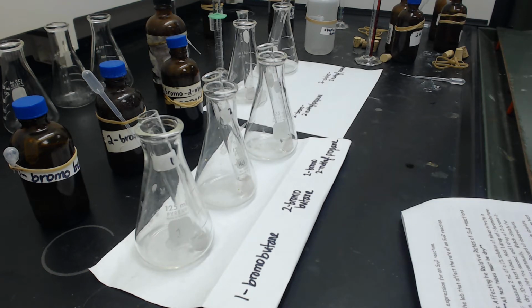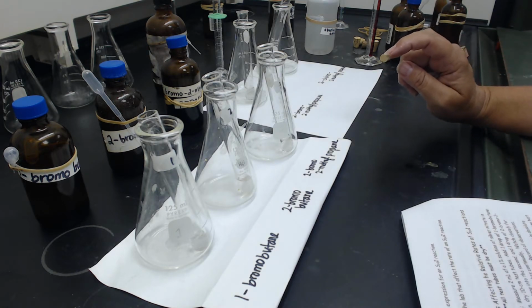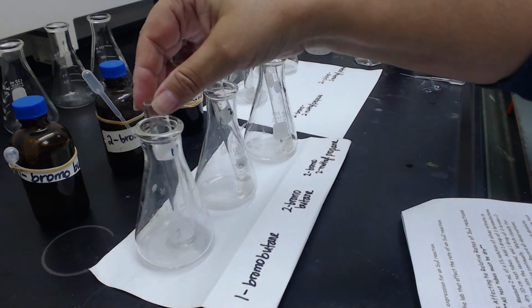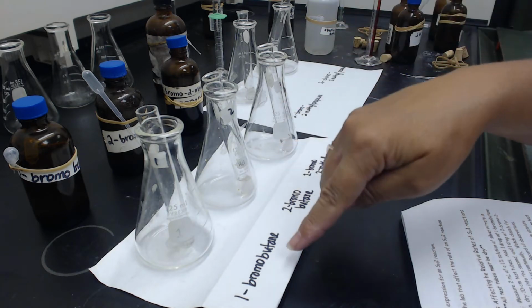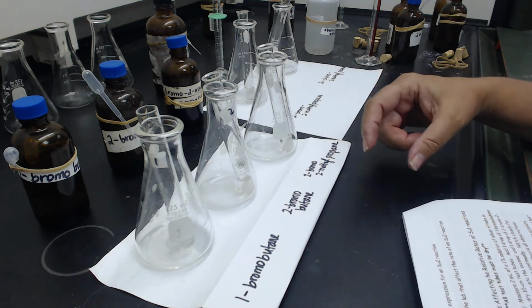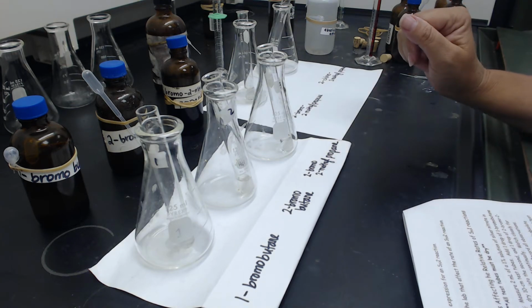So what I'm going to do is, it says to put 2 milliliters of a 1% solution of silver nitrate in absolute ethanol. So I've already done that. There's 2 milliliters of the absolute ethanol with 1% silver nitrate. And I'm going to add a drop of 1-bromobutane, 2-bromobutane, and then 2-methyl-2-bromopropane. So again, these are 3 isomers where the bromine is either primary, secondary, or tertiary.